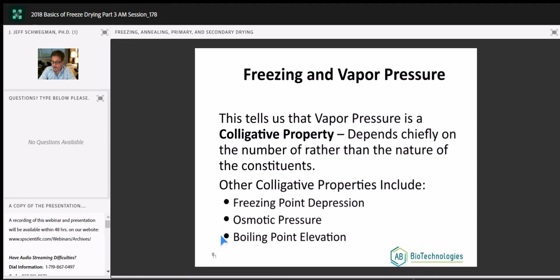If you've ever bought an instant cake and you read the back of the box, it says, if you're at sea level, bake it at this temperature for this amount of time. If you're in the mountains, bake it at this temperature, because the boiling point of water between sea level and elevation in the mountains changes based on the pressure.